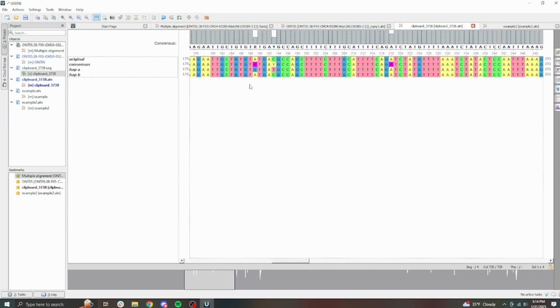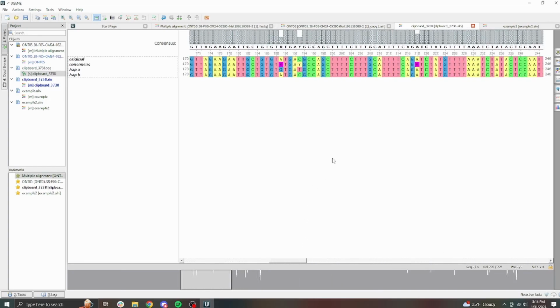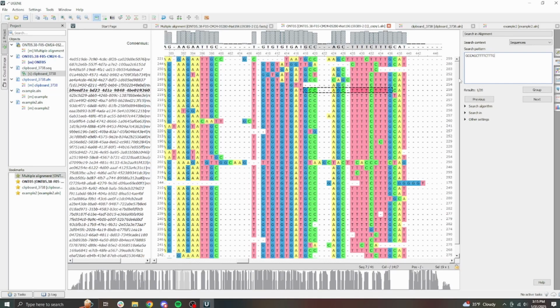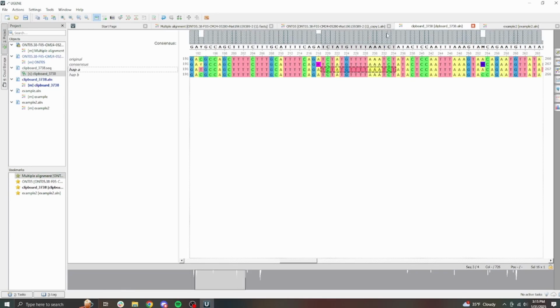So now, what I usually end up doing is going through everything manually just to see what's going on. Because you do run into occasional wonky situations where there's an alignment issue and it didn't quite detect what was going on. Like right here, I'm going to guess the initial alignment was just wonky. Normally it's not an issue, but when you get these polymorphic sequences, sometimes you do get some strange alignments with the computer algorithm. Now I know this G, this R, and this Y are definitely there because I already checked them.